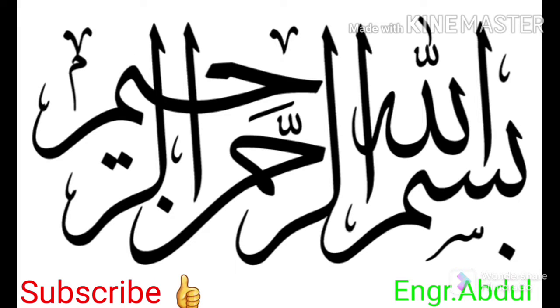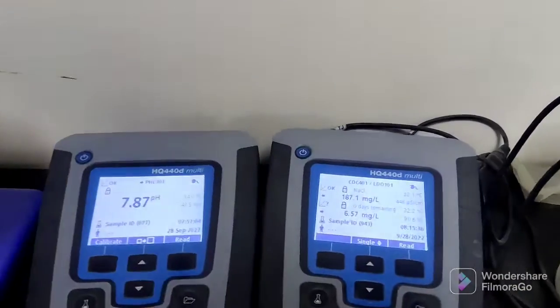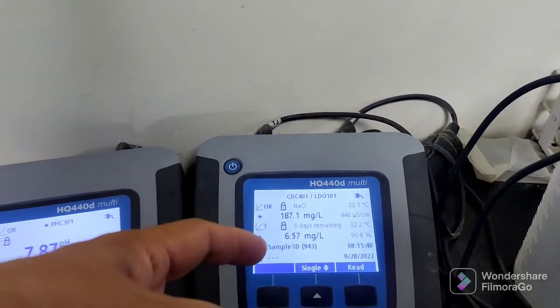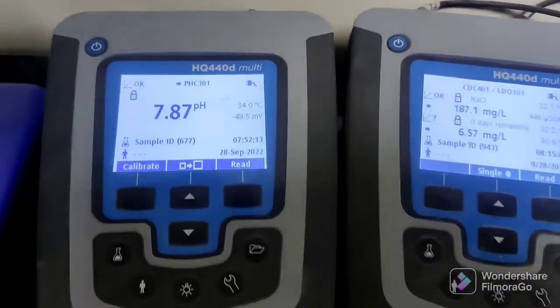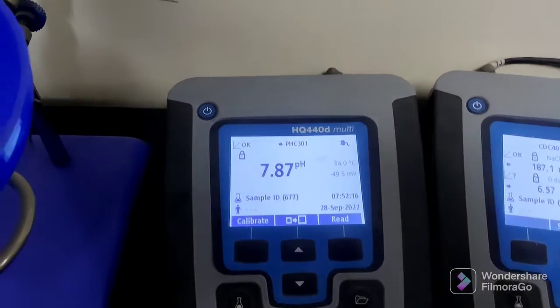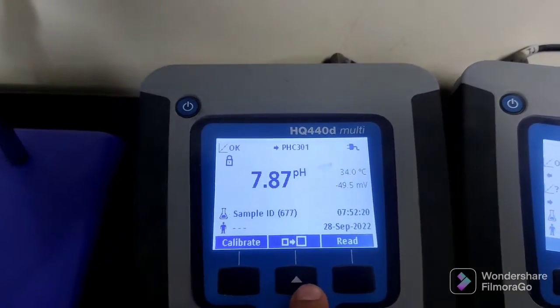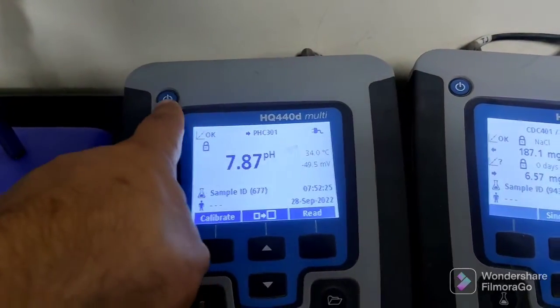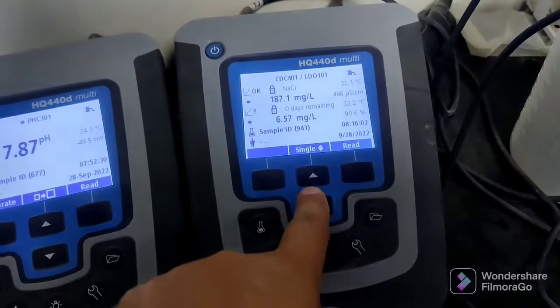Hello guys, good morning. Today we are discussing about the pH and DO and connectivity meters. This meter is showing the conductivity, and this one is showing the pH. On the screen, this button is for reading, this one is for calibration and other settings — don't touch that. This one is the power switch.